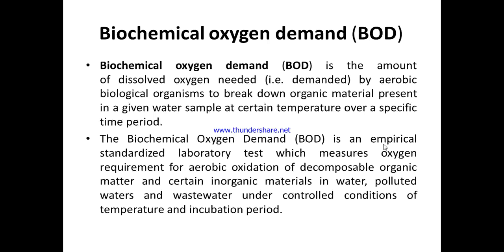Okay, so we will discuss in detail how we determine the BOD and what the procedure will be, means how we will proceed for the lab. We will first discuss the theory and principle involved in the biochemical oxygen demand BOD test. Then we will be learning about the apparatus and reagents required. Then I will be telling you the procedure involved. Then I will be showing you the lab video that we have prepared for you, how to determine the BOD. Then I will be telling you the calculation and conclusion, as well as the environmental significance of this biochemical oxygen demand.